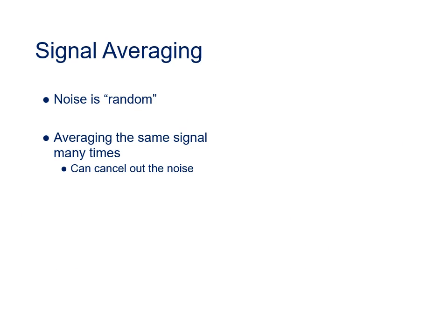If you've collected a mass spectrum and you can see that the signal-to-noise ratio isn't high enough, what can you do? Well, you might be able to increase the signal by making the sample more concentrated or by injecting a larger aliquot. But because the noise is random, there is another option, whereby we can reduce its impact by averaging multiple measurements or by measuring for longer.